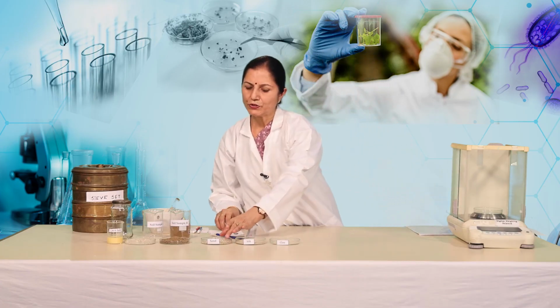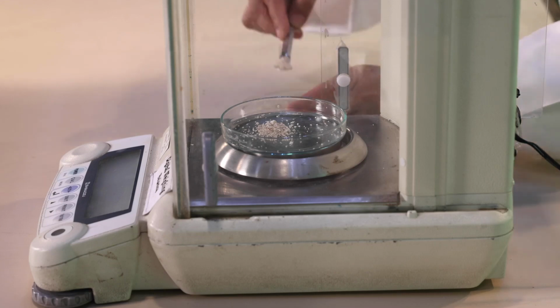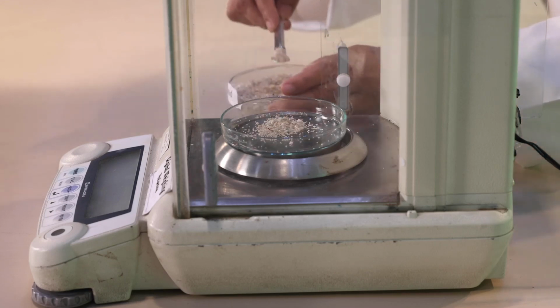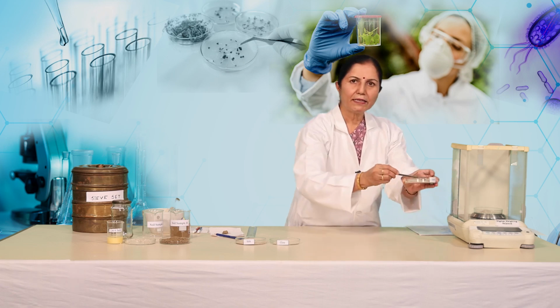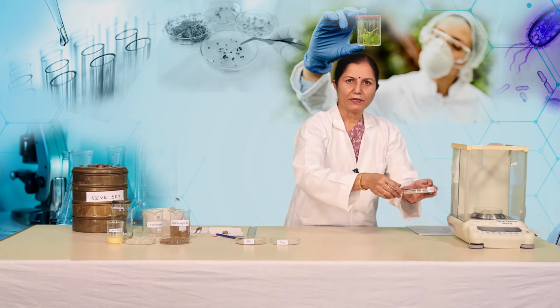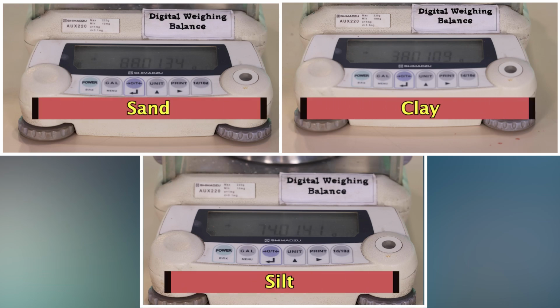Transfer one of the soil fractions, for example sand, into this petri dish and take the weight. Similarly, we can transfer the entire sand into this petri dish and calculate the percentage of each fraction and tabulate the results in the table.